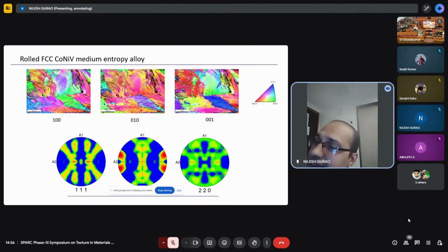If you want to determine the grain size, life is tough. Because why? You have to prepare optical microscopy, then you have to use image software, use a horizontal intercept or vertical intercept. People are lazy. They feel, let us use EBSD. I will do EBSD, the scan will come, then I will press a button and I will get your average grain size. And I will get a standard deviation. My job is saved. I don't have to do anything, right?